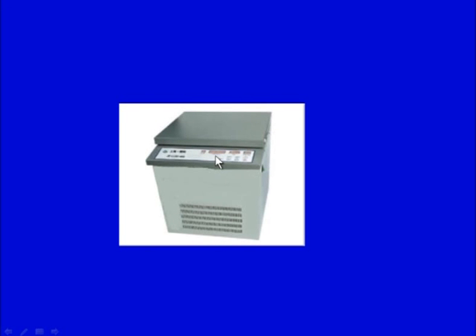They are used to pellet substances that sediment rapidly, like say RBCs, certain bulky precipitates, or yeast cells, nuclei and chloroplasts. A lot of other things could be worked upon here for certain applications. This is a typical high capacity refrigerated centrifuge, as you can see, and this can carry 4 to 6 liters of material. These could vary in capacity, and various types are available in this range.